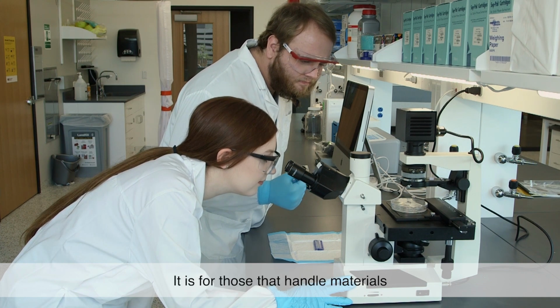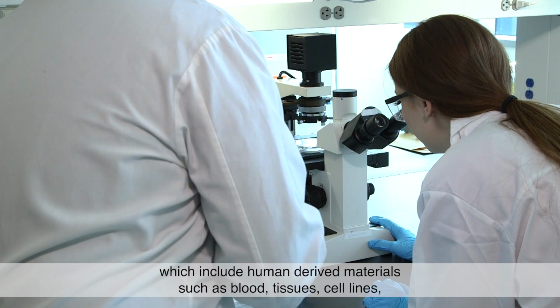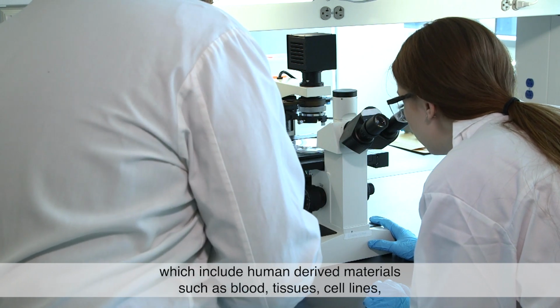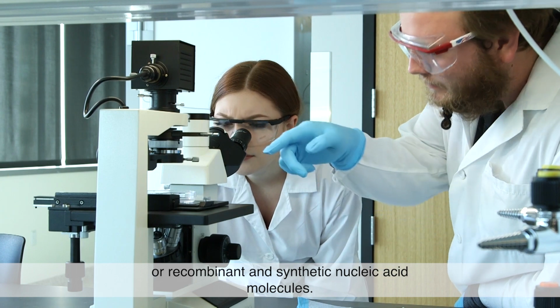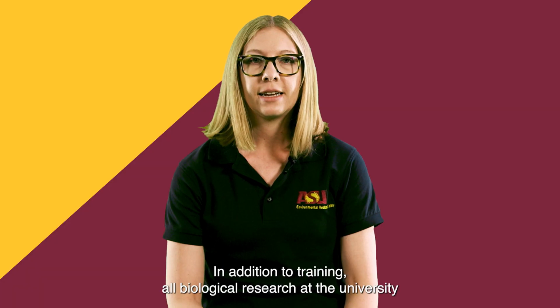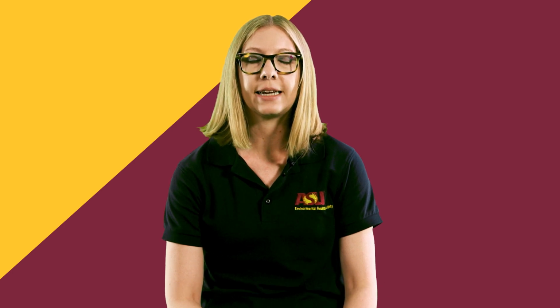It is for those that handle materials that are potentially infectious to humans, plants, or animals, which include human-derived materials such as blood, tissues, cell lines, or recombinant and synthetic nucleic acid molecules. In addition to training, all biological research at the university must be approved by the Institutional Biosafety Committee.